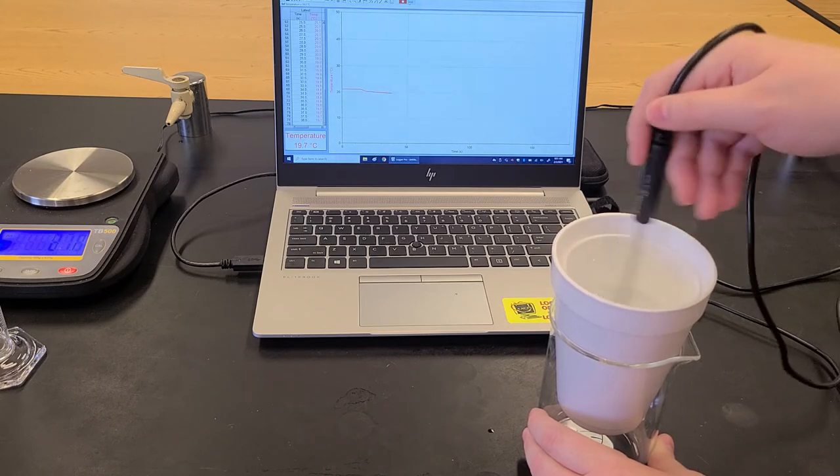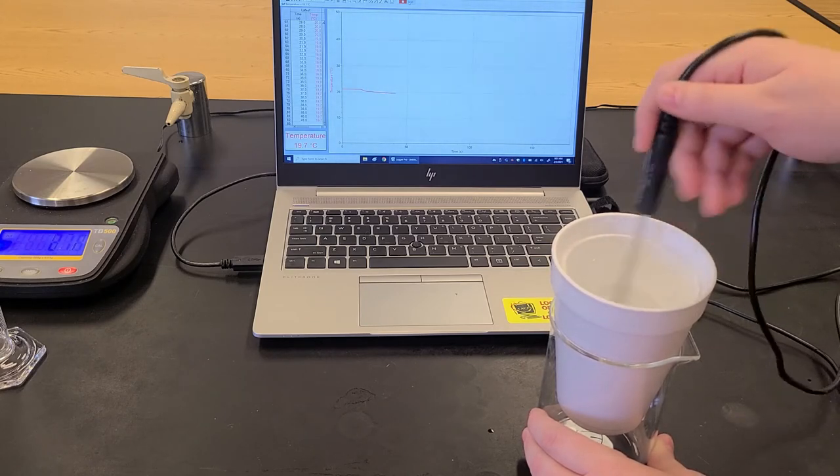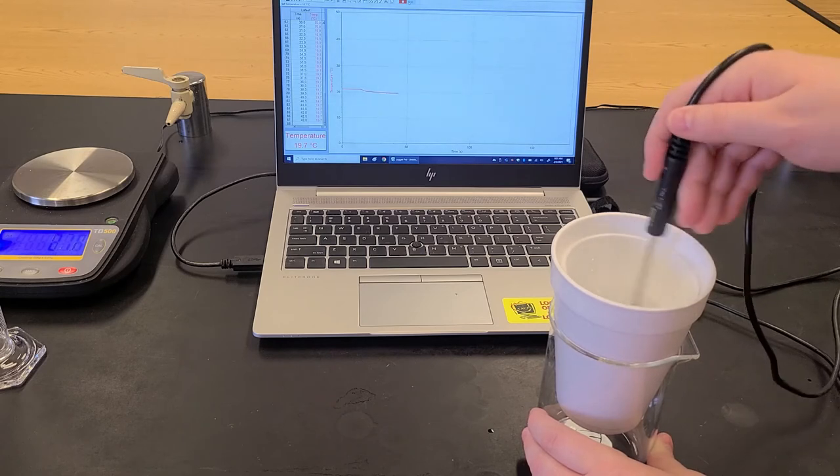So we want to make sure that this is all completely dissolved in there and that we're getting the heat change for the total mass of solid.